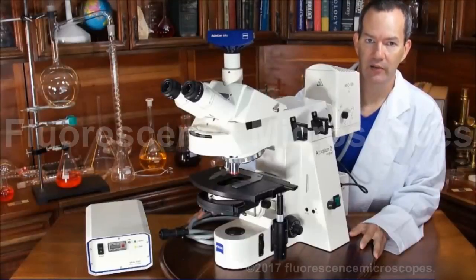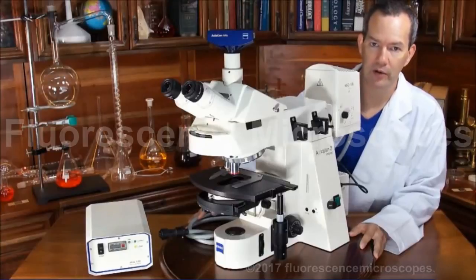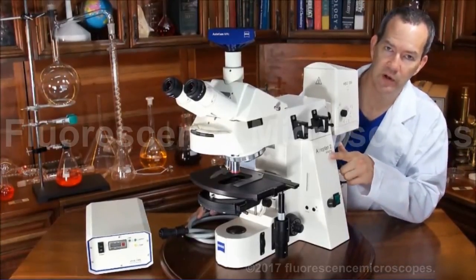This is a Zeiss Axioplan II Upright Fluorescence Microscope. It's the Axioplan II imaging version.